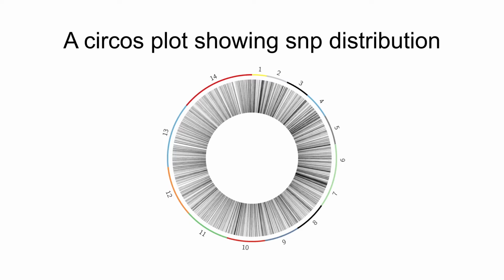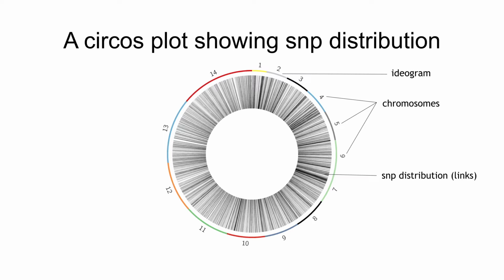So let's look at this plot here. We have the ideogram, which is the outer one.